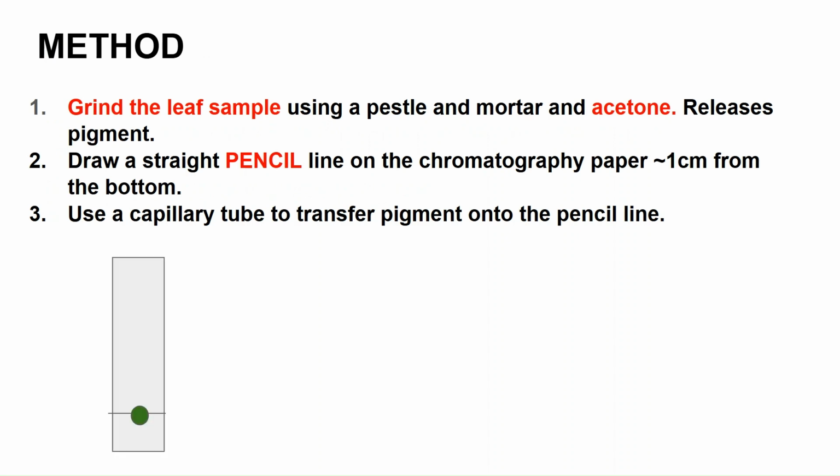This is just a schematic representation because I'm doing this from home. I don't have access to a lab. So you have your piece of paper there with your pencil line and then your dot of pigment right in the middle.